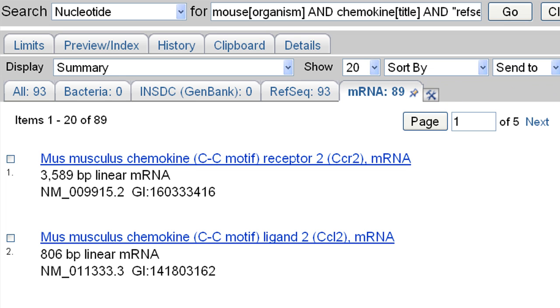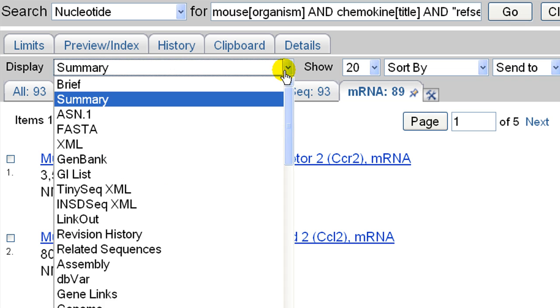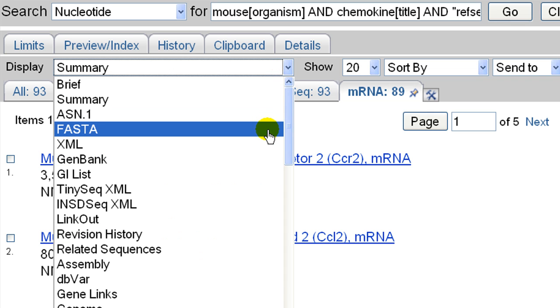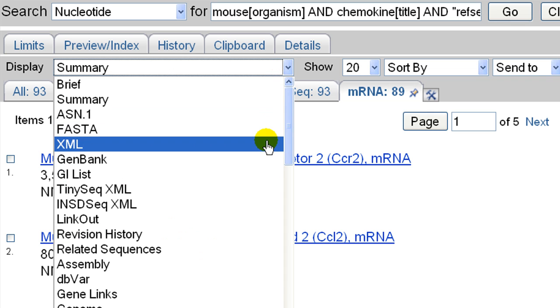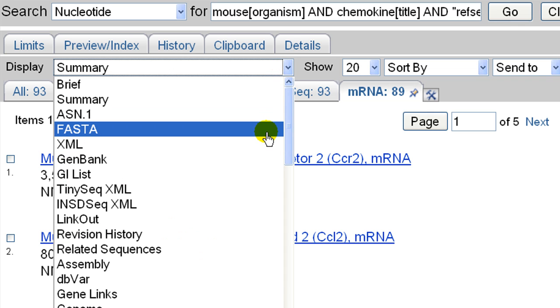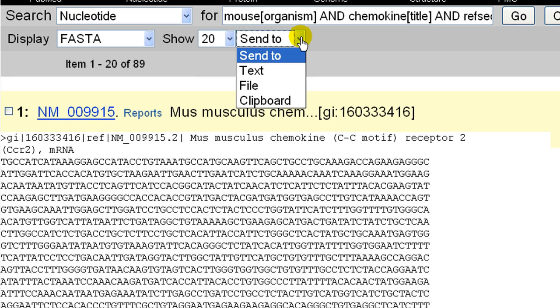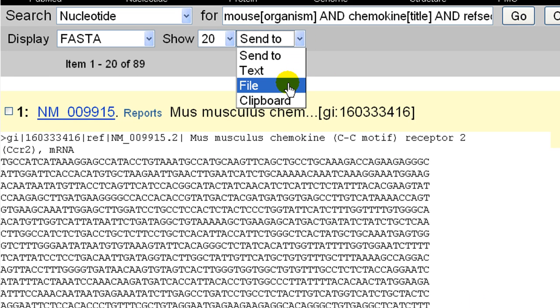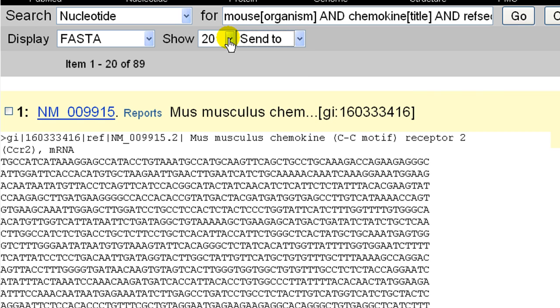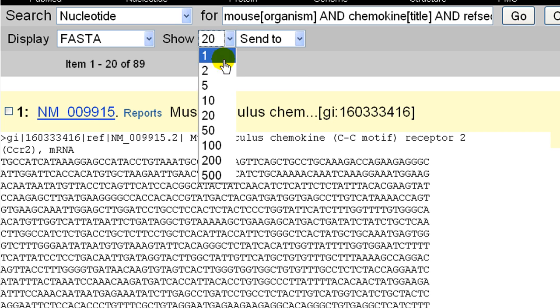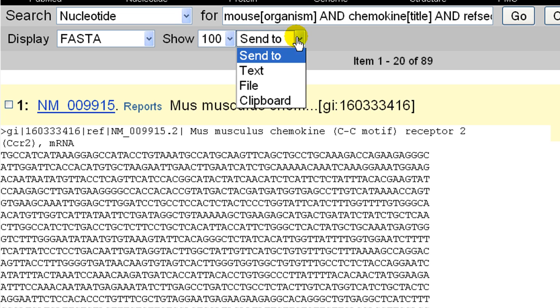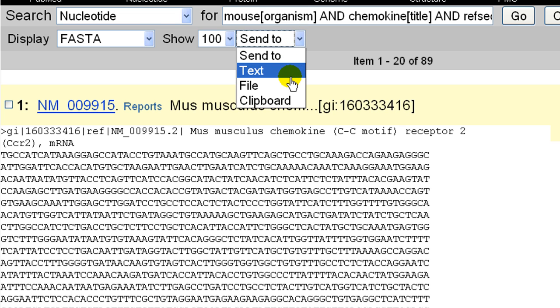Use the display menu to select the format that you want to download, for example FASTA or list of GI numbers. I'll select FASTA. Choosing Send To, then File, allows you to save a multi-FASTA file of all 89 records. If you wanted to display all 89 on the webpage, you first would have to set Show to 100, then choose Send To and Text.